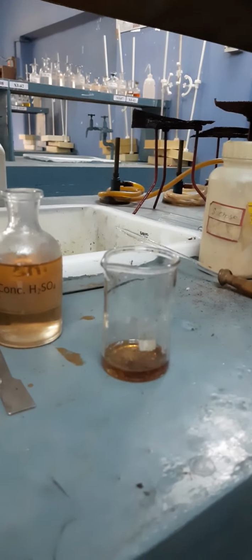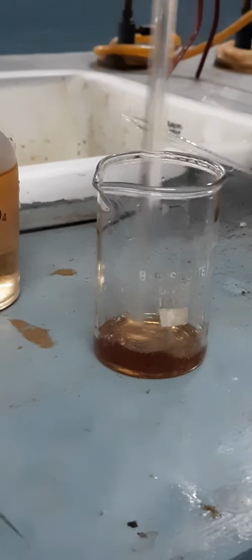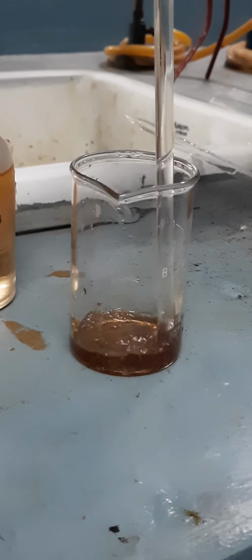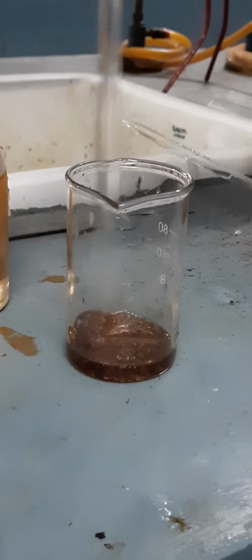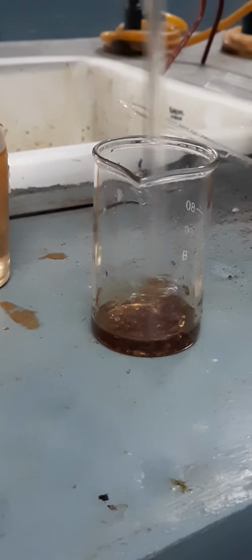If I slowly mix this, it will turn black. You can see that the color is changing and it is turning black.